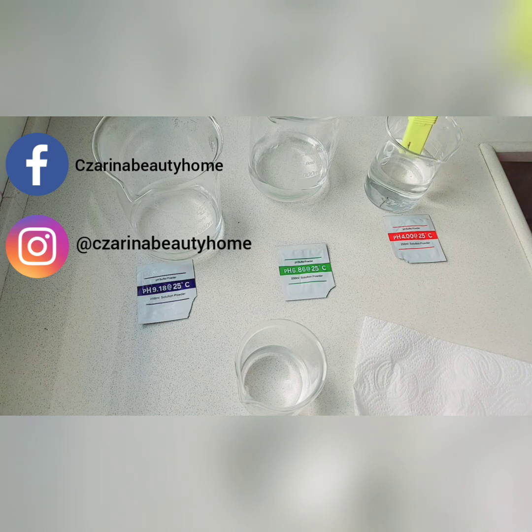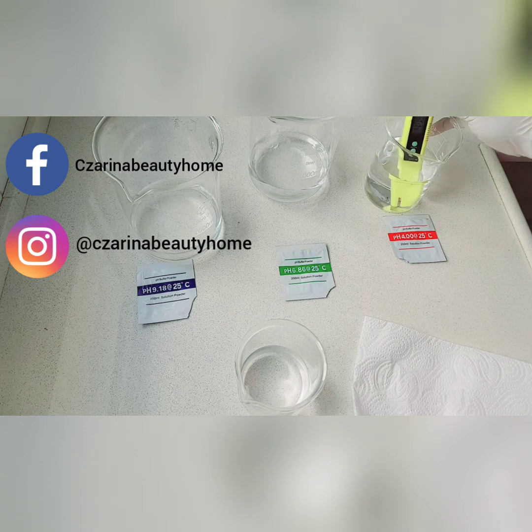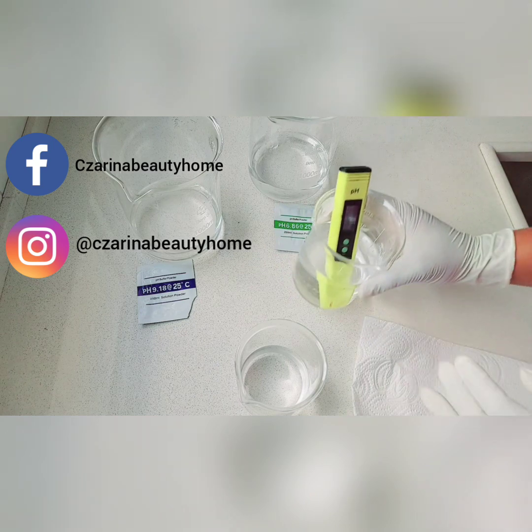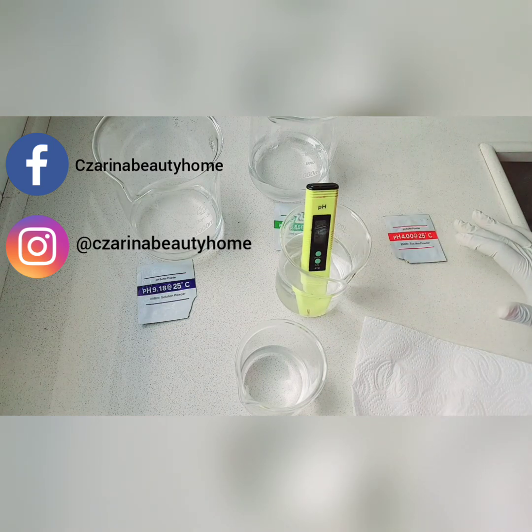If you flip the pH meter, you'll see the sensor — it looks like a bulb. Don't ruin that. That's the sensor, and if you get it broken, the pH meter is ruined and you can't use it anymore.